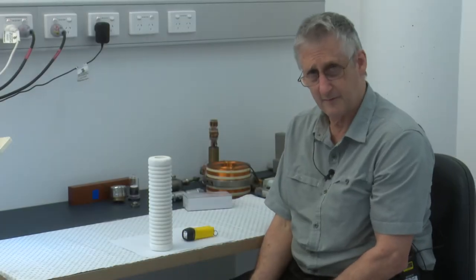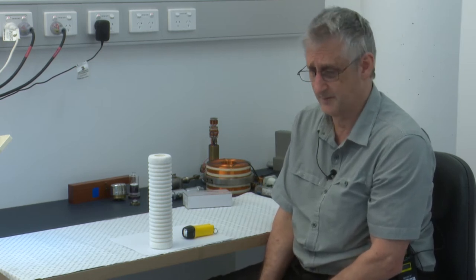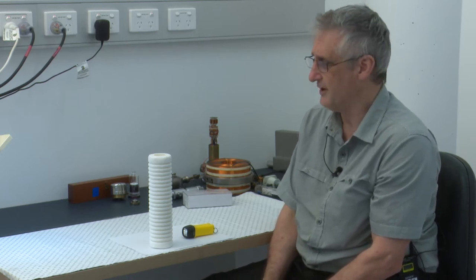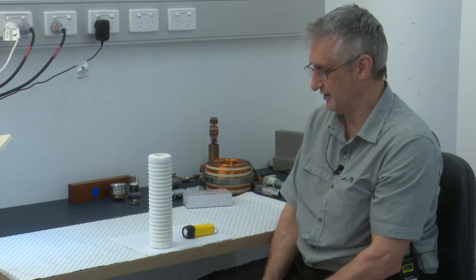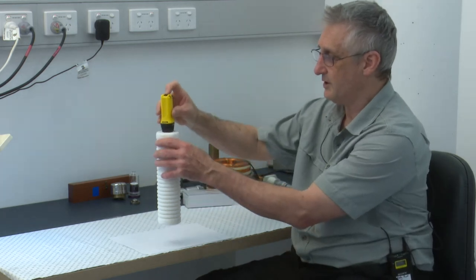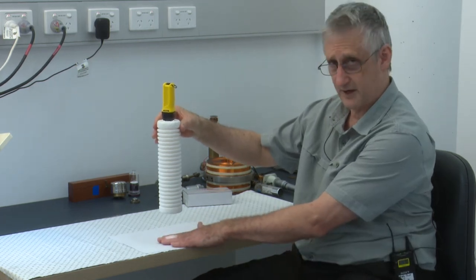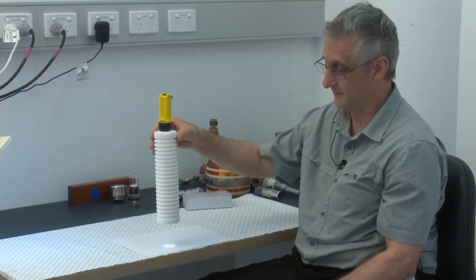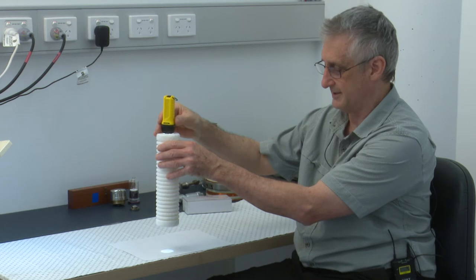So we've talked about filaments, we've talked about the electron optic system. We need to align the electron optic system, and we generally start at the top aligning the filament. Really what we're trying to do is to make sure that we have our illumination shining centrally down through the column, giving us as much signal as we possibly can have on our specimen. It can be thought of very simplistically as just a tube with a torch on top. And as I put that torch there, you can see my illumination is going right down through the center. Because the energy is regularly changed, anywhere between 0 and 30,000 volts, it's important that we are able to readjust the position of that filament to make sure it's always shining down through the center.